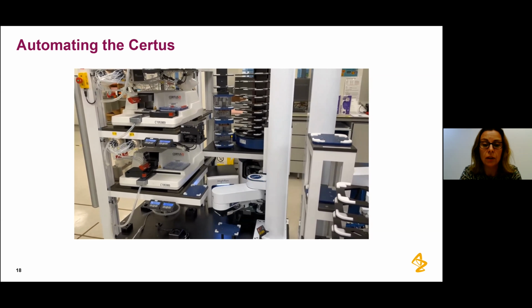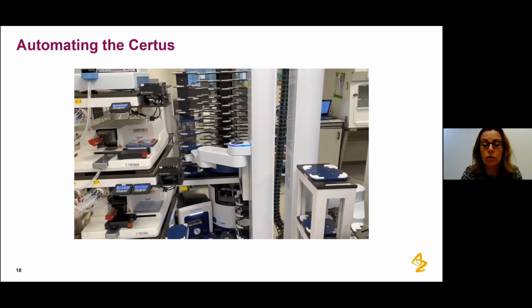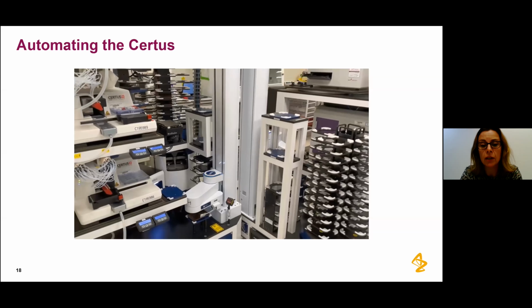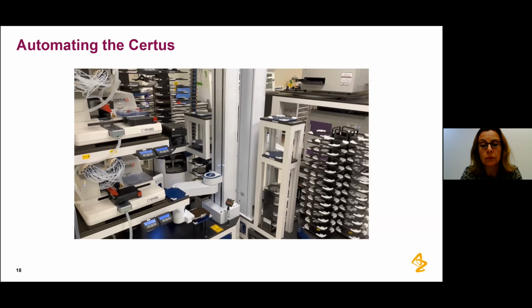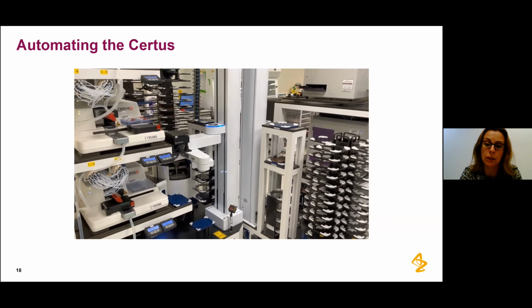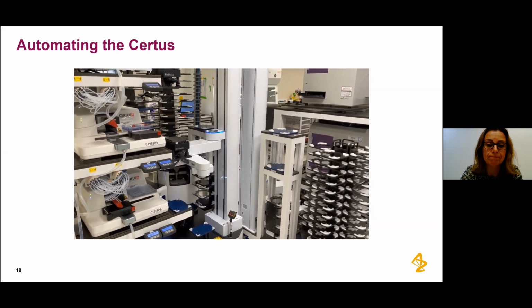You can see here that the precise robot has now gone to pick the next plate to hand over. I'll show the handover onto the reader cart. So it's popping its lid back on, regripping to hand it over in the correct orientation. And now the precise robot on the reader cart will come and access that plate and place it into its random storage location, while the second plate is just about to finish dispensing on the CERTUS.